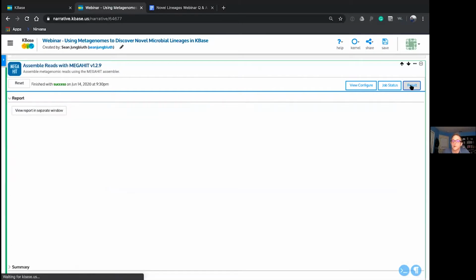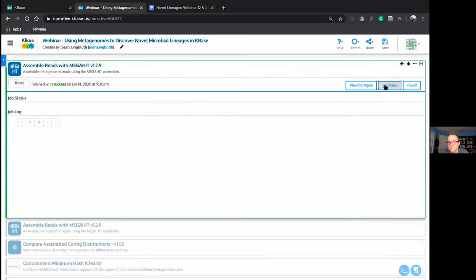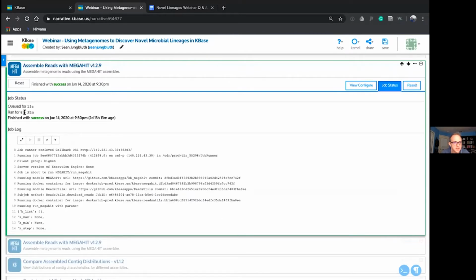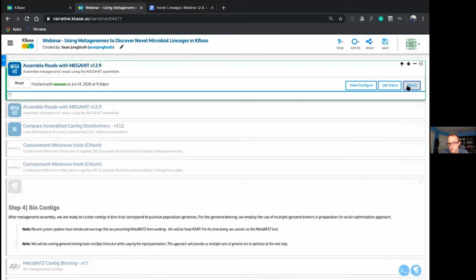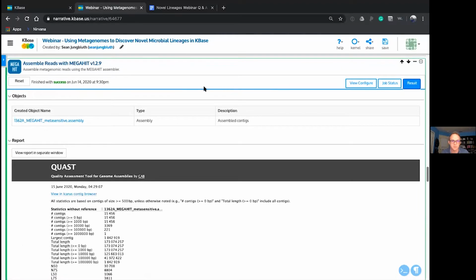So this tool ran in, I would say, like 8 hours, 12 hours, something like that, just to give you a sense of how long. Actually, I can tell you exactly: 8 hours, 35 minutes here. So for 300 million reads, I would say that this is pretty darn quick, just to give you a sense of timing and the power of our equipment here at KBase.